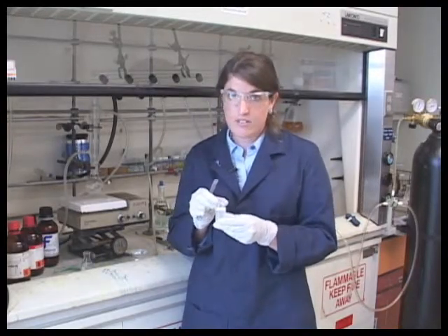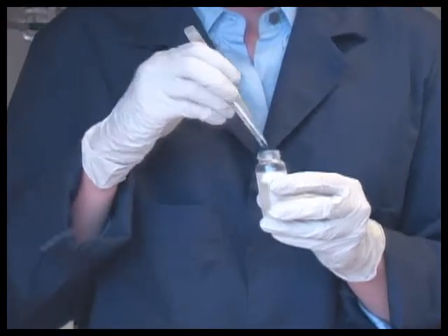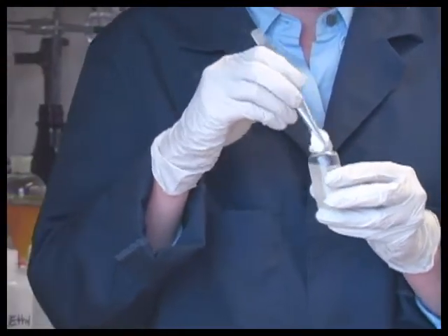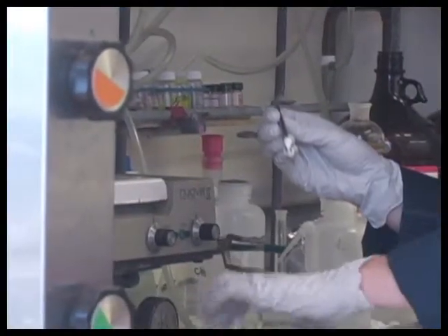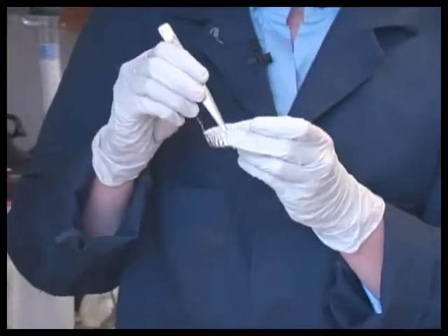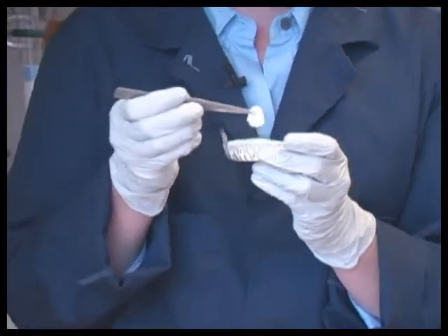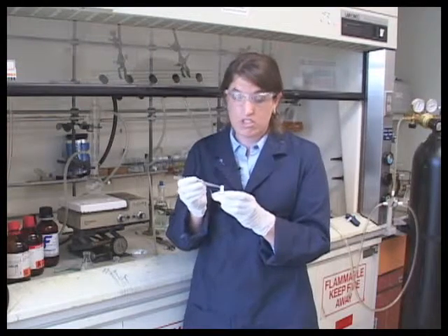Once we've added all of our peroxide and allowed the vial to cool a little bit, we can take out our glob of polymer. This polymer has neat characteristics because it stays flexible at low temperatures.